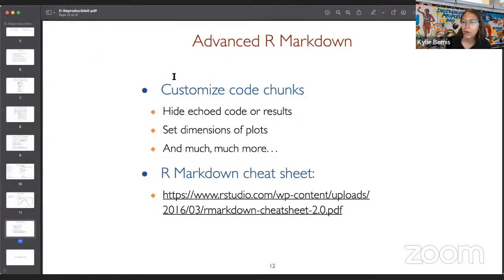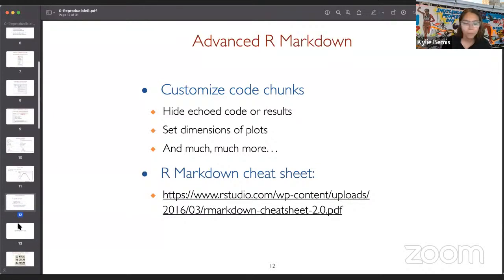So you know how we create things like vignettes when you see them in R packages. And just so you have an idea that this tool exists to create reproducible, polished reports using R code.